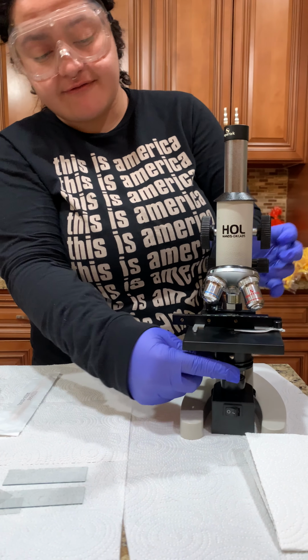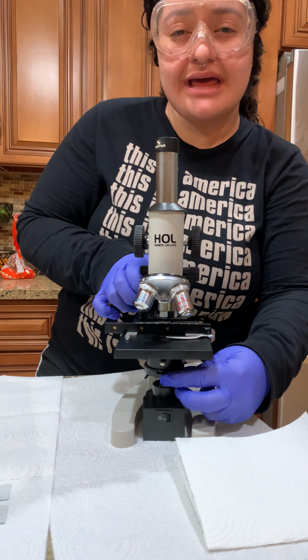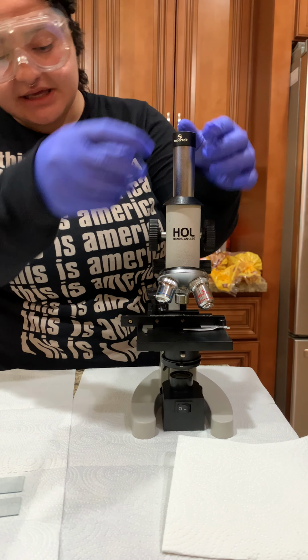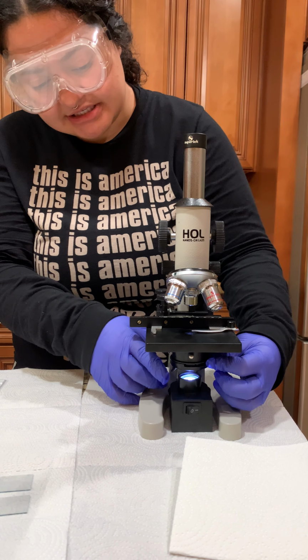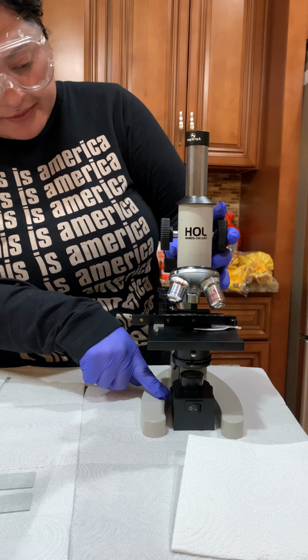Down here is a diaphragm. There's a knob that you're able to turn, and that controls how much light you're allowing into the slide, which goes through the condenser lens, which you can see through the eyepiece. Down here is our illuminator. That's the light. So this works hand in hand with the diaphragm. It controls how much light goes in, and then you can turn that off as well.